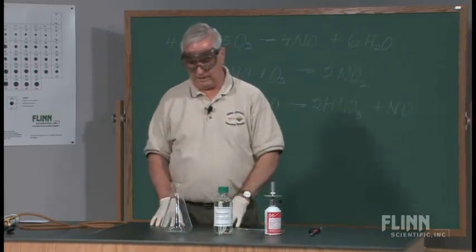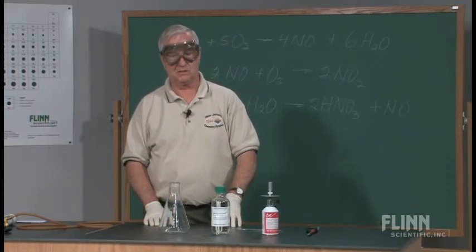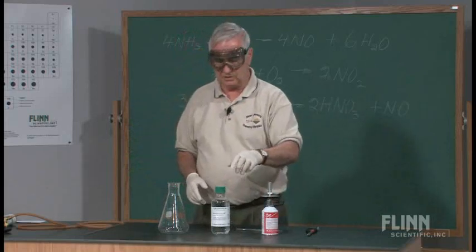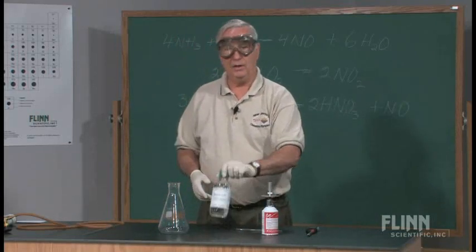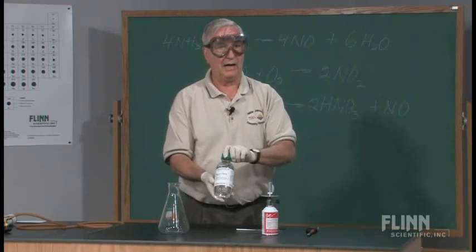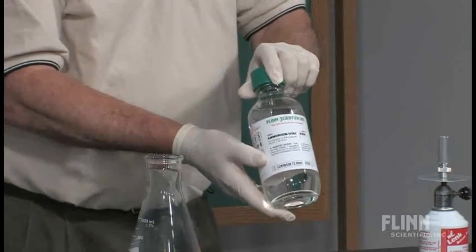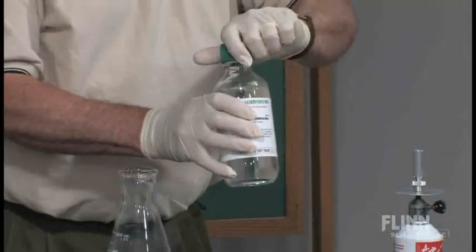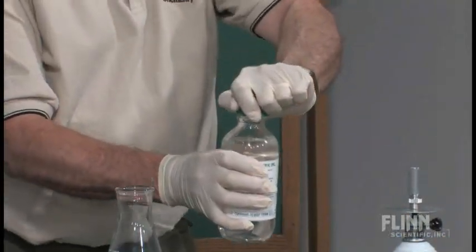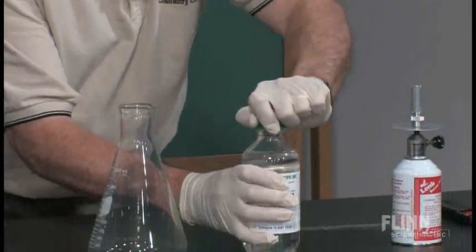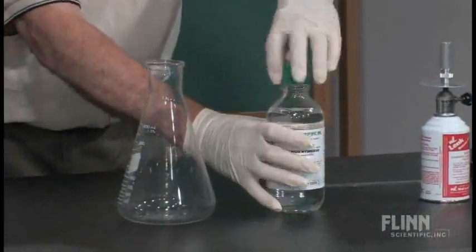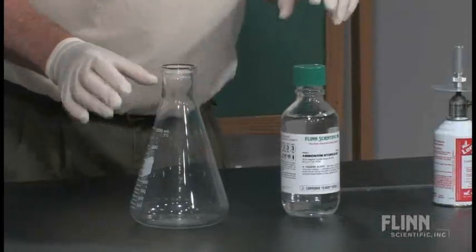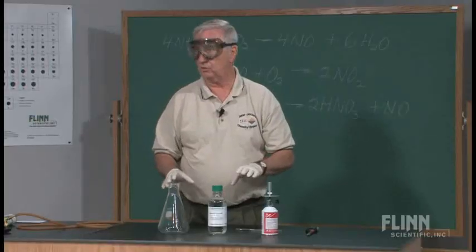What I would like to demonstrate is actually the Ostwald oxidation of ammonia, of course, on a very simple laboratory scale. I'm going to use ammonia which is going to be gas that is released from aqueous ammonia solution. Remember that this is approximately 14 molar, and it has a high concentration of ammonia gas. Now I'm going to pour a quantity of it into the flask so that this will be our source of ammonia.